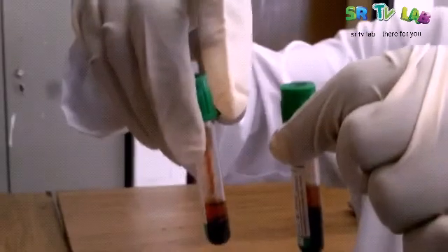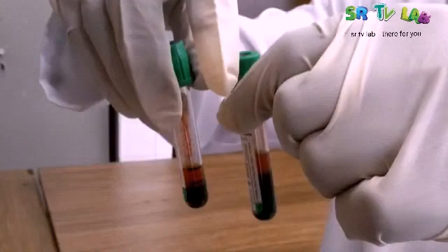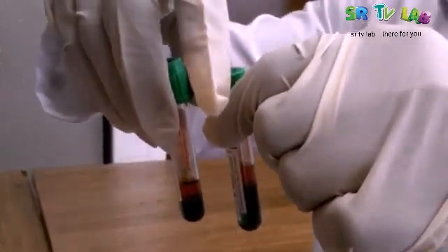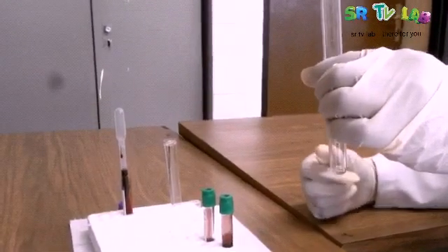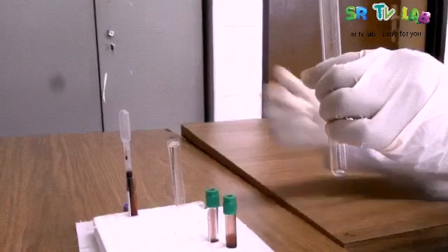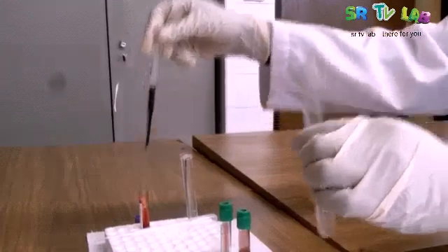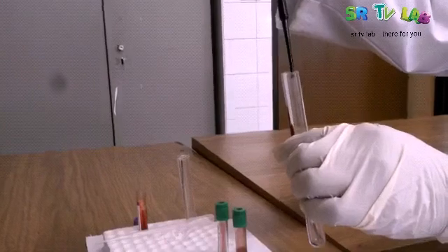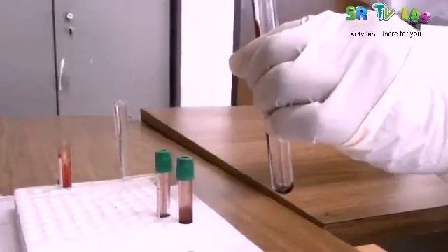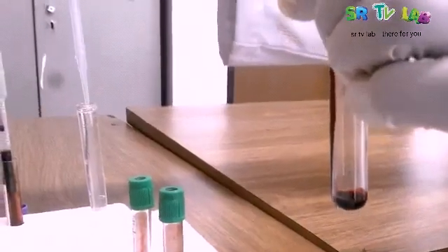The next step is to add some water to see how it is going to look like, and we will be checking the haemolysis. Here we have an empty tube. We are going to add a sample of blood with anticoagulants so that blood will not coagulate. And then we will add some water and check to see if the red blood cells are going to be mixed with the blood and to see what will happen.